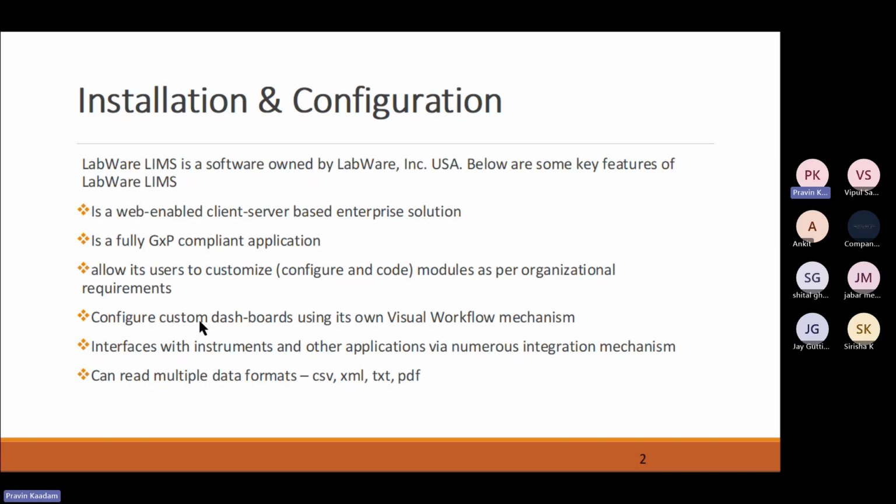Next, you can configure custom dashboards. They have a very unique utility called visual workflow. This visual workflow allows you to create dashboards, and you can assign a dashboard to an individual user or a group of users.